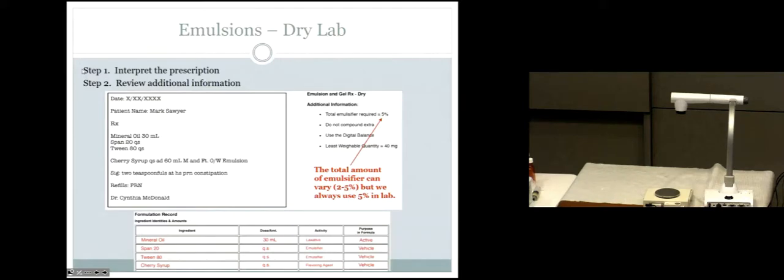Let's read and interpret this prescription. Mark Sawyer needs mineral oil 30 mls — obviously having some laxative issues. We're going to take that effective but gross-tasting mineral oil and add Span 20 and Tween 80, 'as much as you need,' because those two ingredients represent the emulsifiers. Then mix with cherry syrup up to a total volume of 60 mls. Basically about half cherry syrup, and the other half mineral oil with whatever emulsifiers are needed.